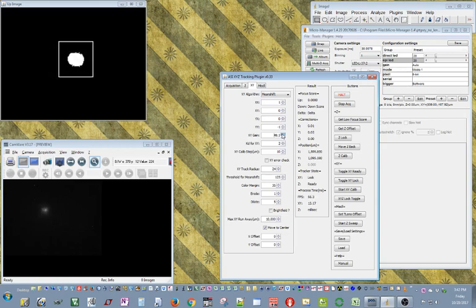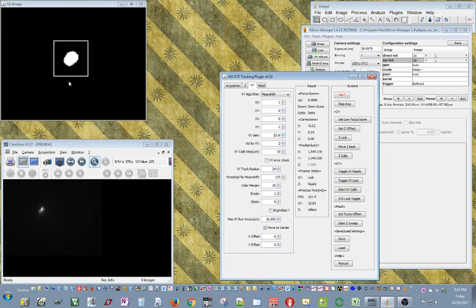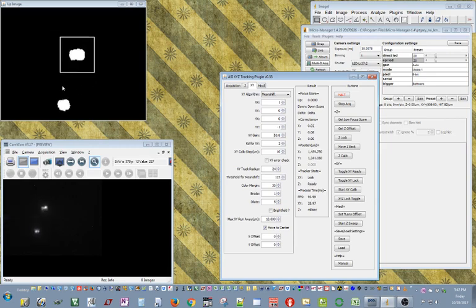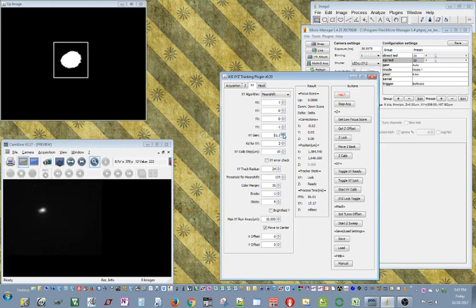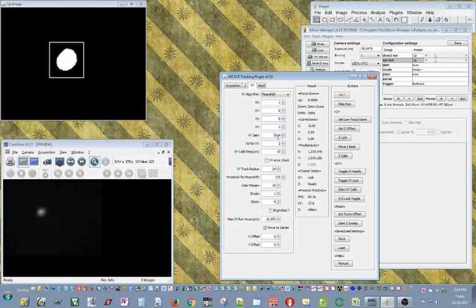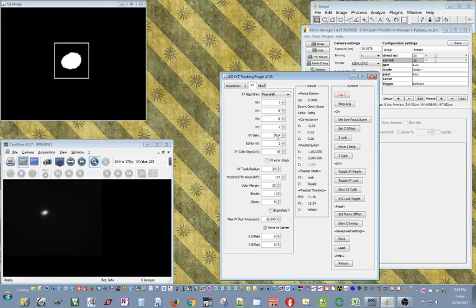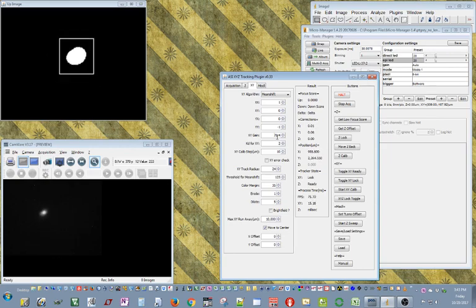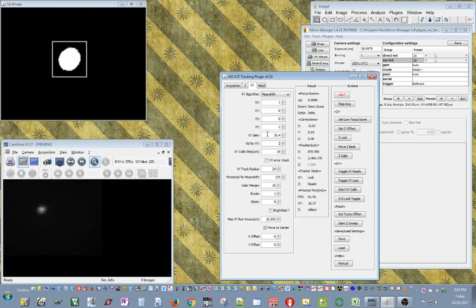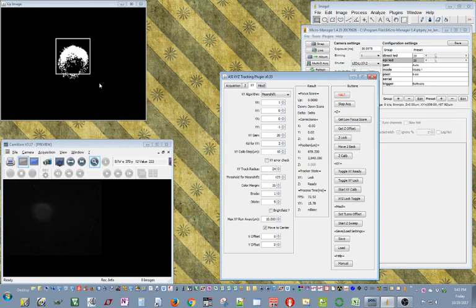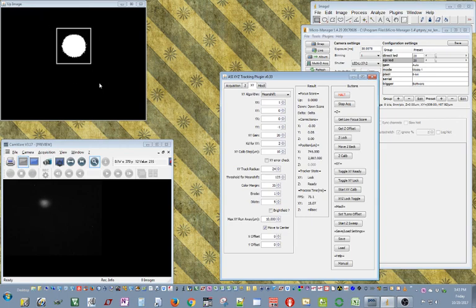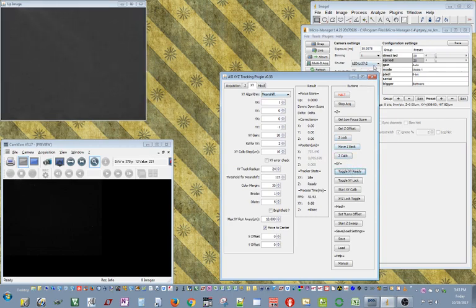I believe about 27 seems to be good enough. And yeah, so you can try and see what works best for you. At some point, I think you're going to start seeing it yo-yoing a bit or make unnecessary corrections. It starts to rank. Okay, let's see here. 50. And right now, wow, let's try. I think a good measure of when the settings are right is the worm is going to stay pretty centered in the center of the image. So let's see if you can find a point where it starts to make too many corrections and lose the worm. Okay, we are seeing some Z-drift. So I'm going to fix that. Yeah, now you see it's more shaky actually. So it's bouncing a bit more. It feels a bit more elastic. Yeah, that's coming from a very high gain. Ah, there you go. Now it's like bouncing like crazy. So yeah, you don't need that. I'm going to bring it back to 20. But with too small a gain and the tracker won't be able to keep up with the worm and we lose it.